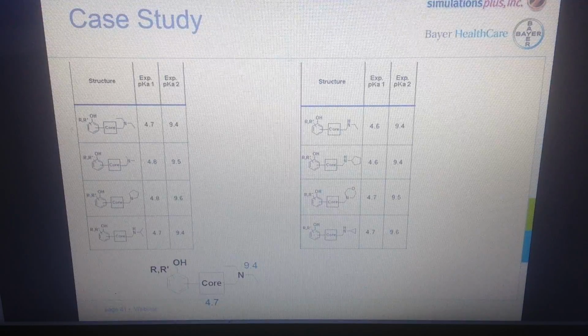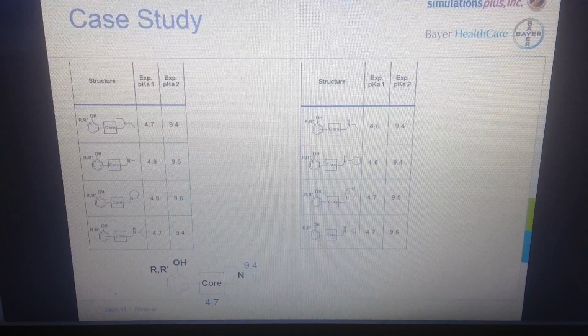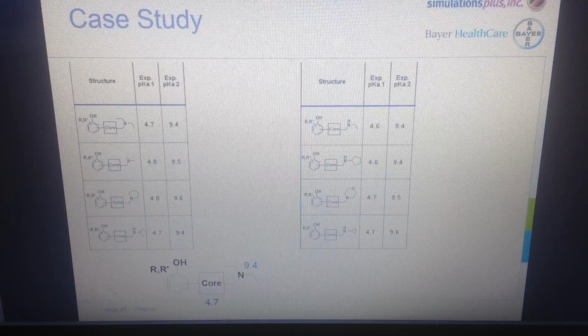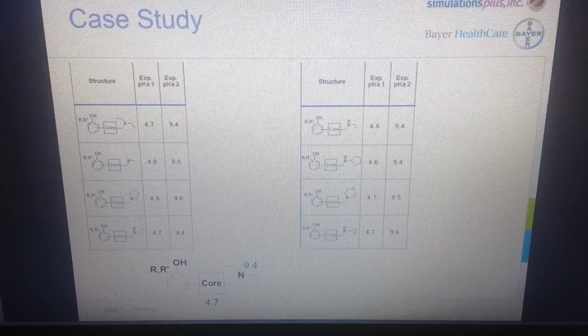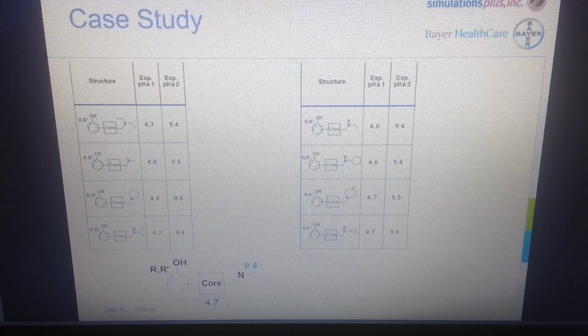And this seemed quite feasible since all those amines initially could be regarded as highly basic. However, for the morpholine group, you can see on the right-hand side, second to the bottom, this was no longer feasible. Here we still measure 9.5, and of course a morpholine group is much less basic.